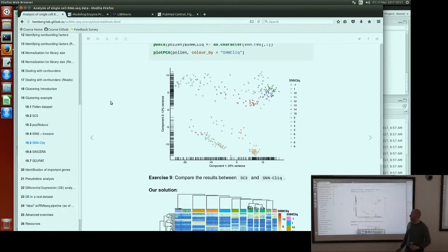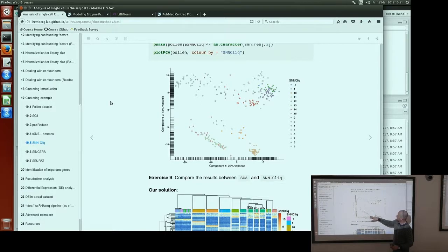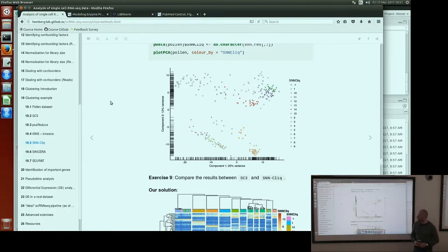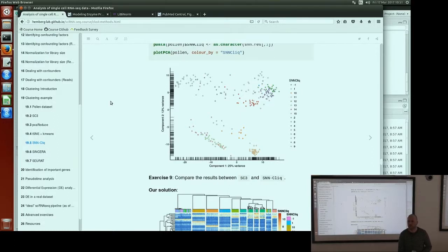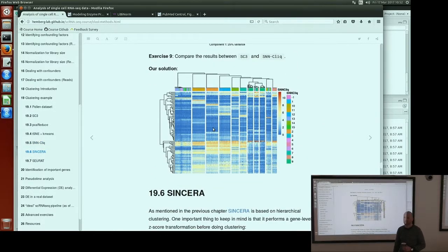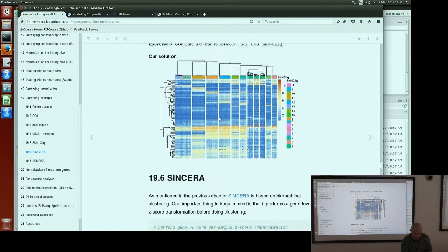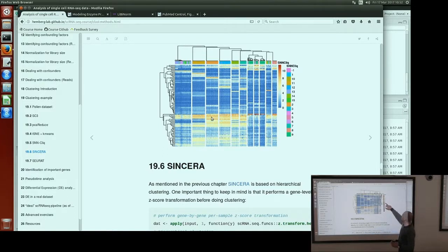If you look at the results of SNN-cliq, this is actually not very good. You can see that it finds three clusters in this cloud, three clusters in another cloud, and this one is a bit messy as well. The negative values mean that cells were unassigned — not assigned to any of the clusters. So those are outliers. Because it found 15 clusters from 1 to 15, the negatives are the outliers.